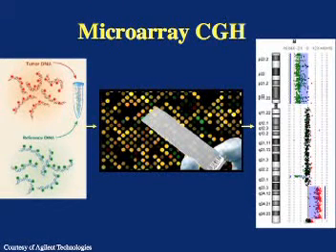In our laboratory, we use the Agilent technology system. This is a slide from them showing actual data from a cancer tumor sample. In this example, you can see that there are two regions with deletions, the green dots, and one region with a duplication, the red dots. Their statistical analysis program labels the regions it considers abnormal using colored bars. In this case, the bar is blue.